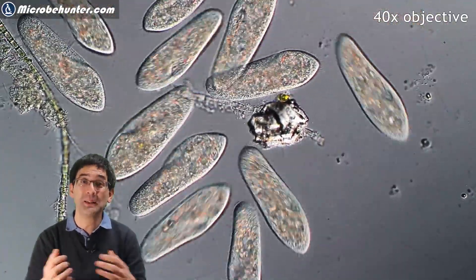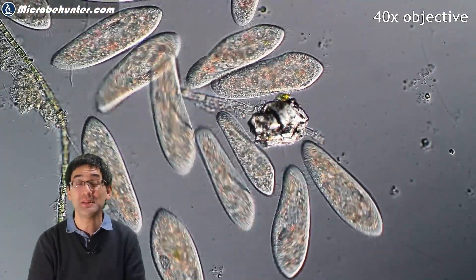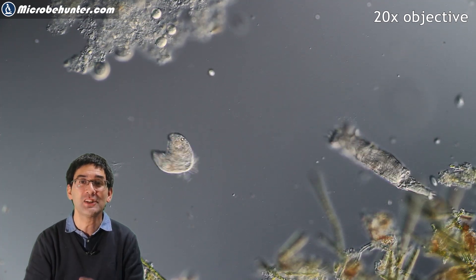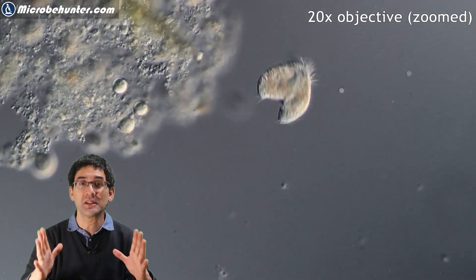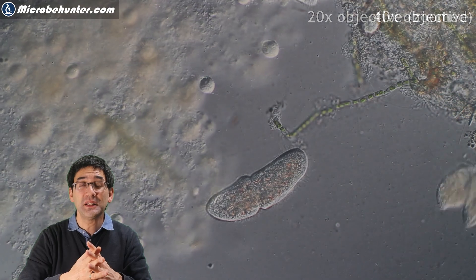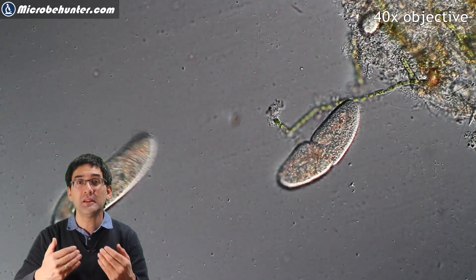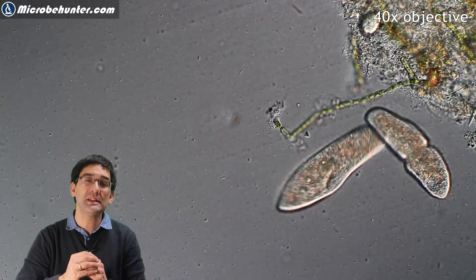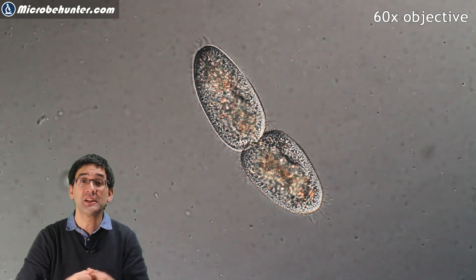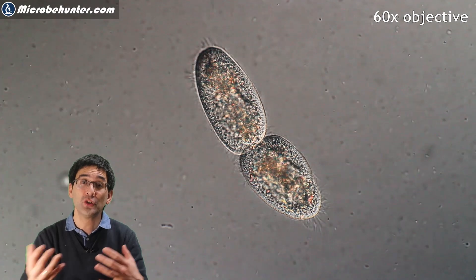What are you going to get? Well, it depends a little bit on your original water sample — what cells and microorganisms were present in the first place. Then we have to go hunt for cells that divide. You might see something like this and say 'wow, it's dividing' — but it's not dividing, it's conjugating, because that's what happens when two separate cells fuse together to exchange DNA. They will separate again but right now they are not dividing. A paramecium that is actually dividing divides transversely, whereas in conjugation they line up in parallel. The two daughter cells that form are also smaller than the original cell — that's another way to distinguish conjugation from division.